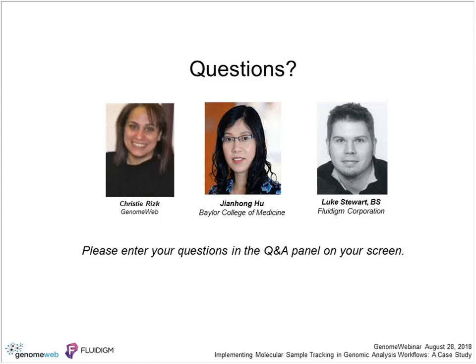Is there a way to easily find low-cost reference samples for validation? Well, Jianhong, how did you identify your reference samples? We basically use some HapMap samples. They have been sequenced before, and then we compare our validation genotyping with previous sequencing to make sure they are correct.